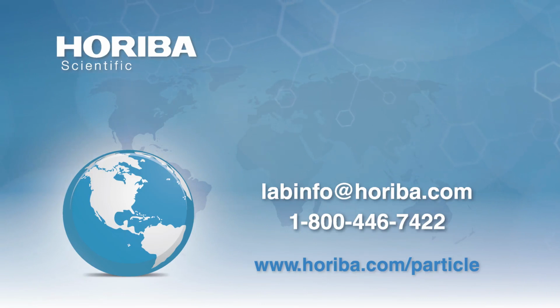Thank you. Okay. Question 2, laser diffraction technique. Would it be able to detect particles in the 2 micron range in presence of larger particles, such as 100 micron? That is the challenge, because if you look at laser diffraction, the large particles scatter a lot more light than the small particles. And so there can very often be a tendency to miss the small particles. You're so focused on the big ones that you don't even have enough little ones in there to make the measurement. So there are different ways you can adjust for that.